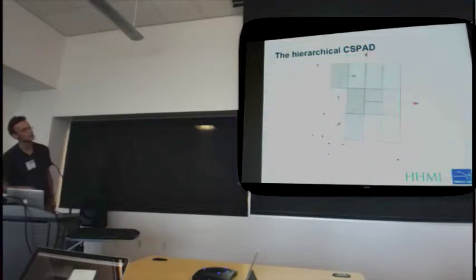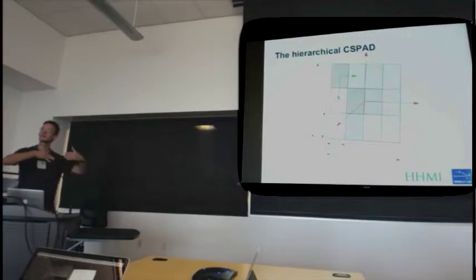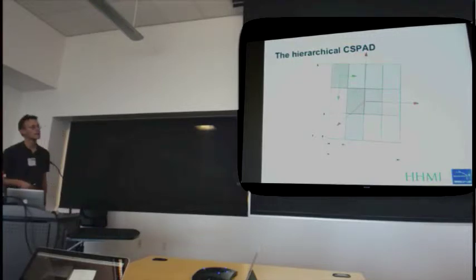So here's just another representation of that. If we're looking at the very lowest level, where we have some mock ASIC with pixels that aren't even square in this case, you would address the pixels by coordinating the fast scan axis and coordinating the slow scan axis. That is then related to the three-dimensional coordinate system of that particular element. What's not shown is that this coordinate system will be related to the coordinate system of the parent, and so on, all the way up to the detector.